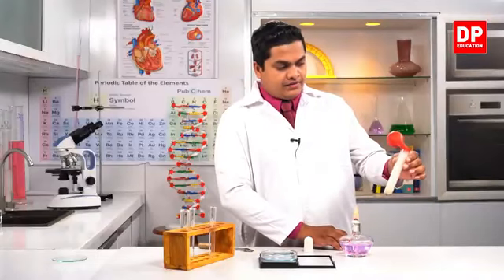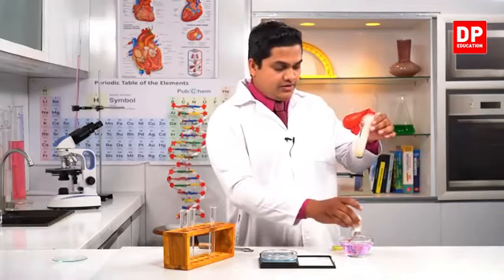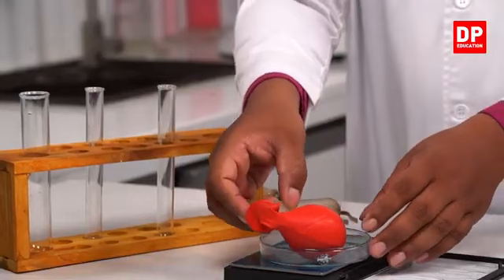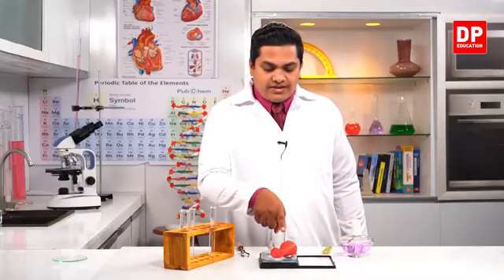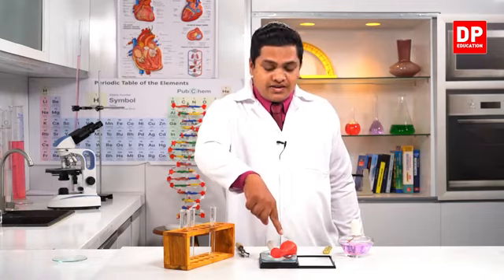Right. Now, my dear children, I'm going to measure the mass of it. So I'll enclose this thing. Right, my dear children. Now, I have placed it in here. Here you can see the balloon has been inflated. See, the balloon has been inflated.